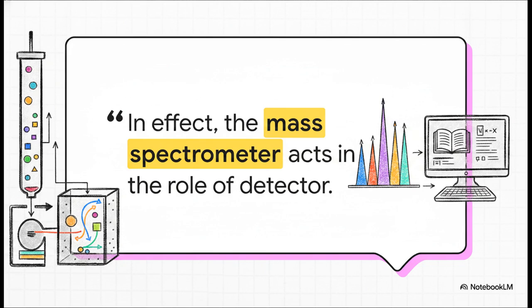Add to that the fact that modern instruments have these built-in computer libraries that can instantly compare those spectral fragmentation patterns with tens of thousands of standard spectra. It literally tells you exactly what just walked through the door.